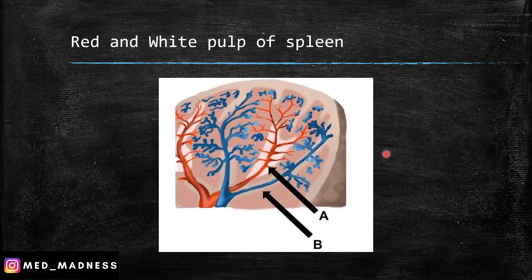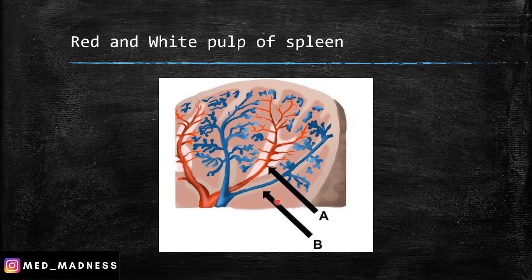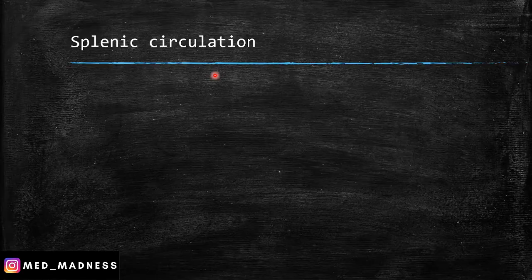Red pulp consists of the sinusoids and the cords of Billroth. Here you can appreciate the PALS — peri-arterial lymphatic sheath — that is around the splenic artery and arterioles. And the major component of the spleen is red pulp.